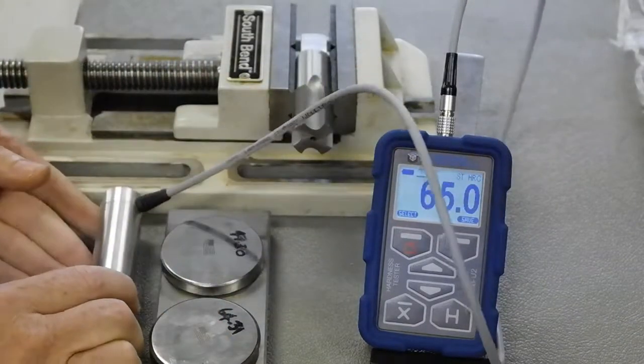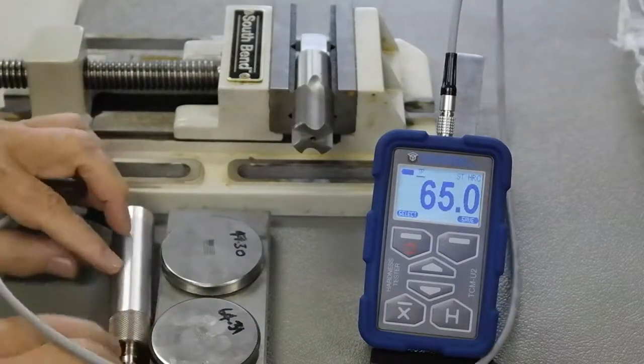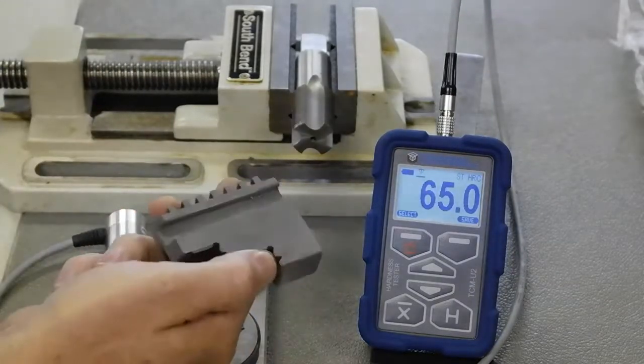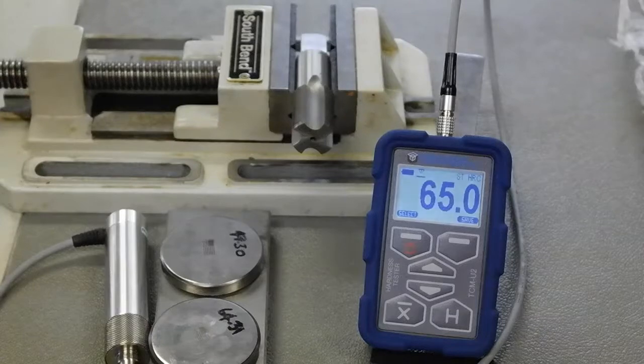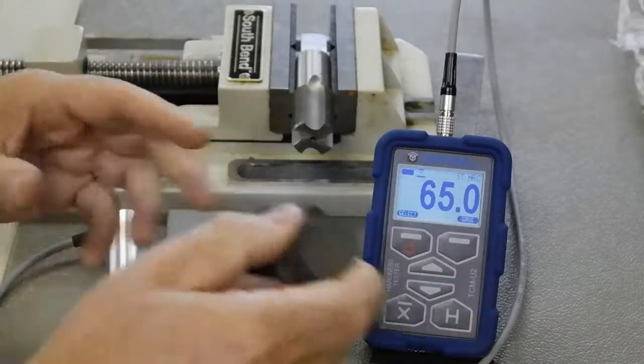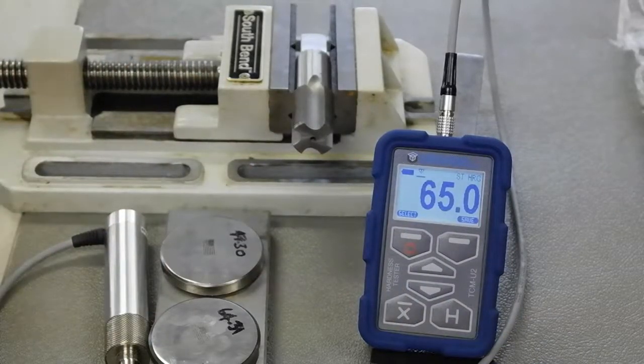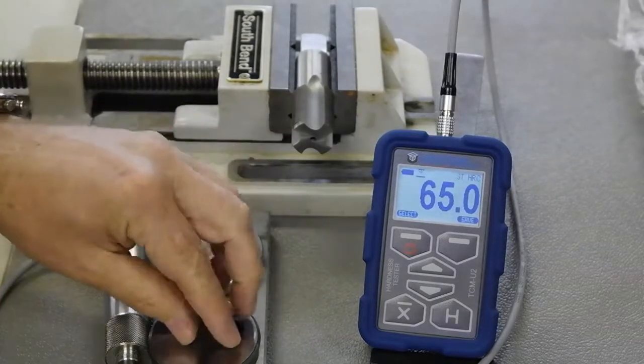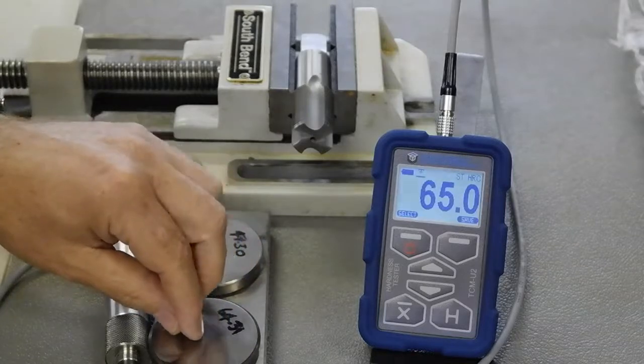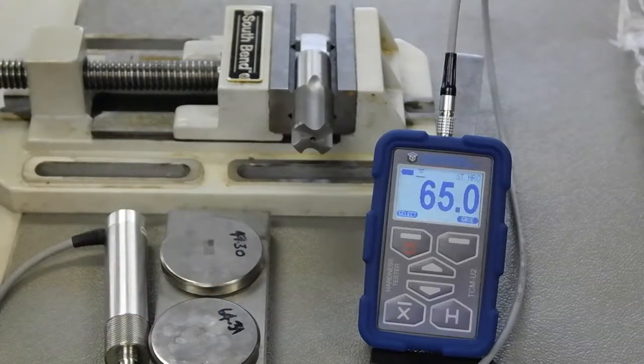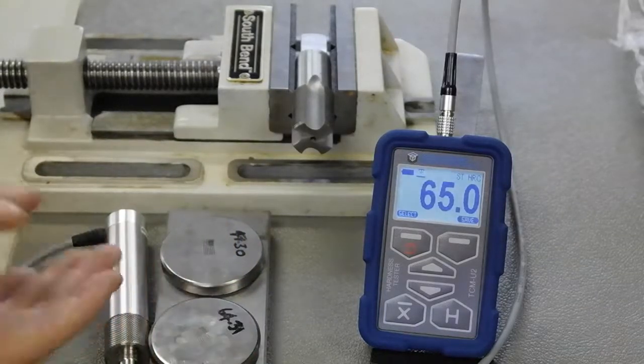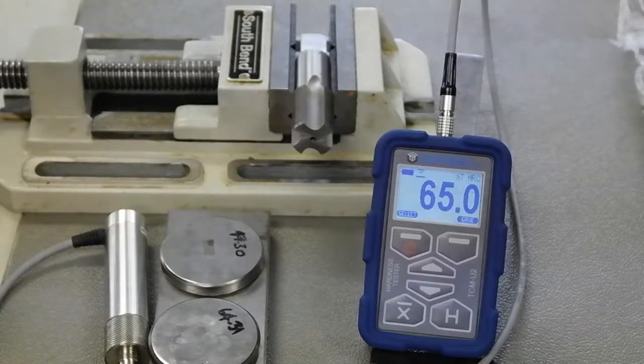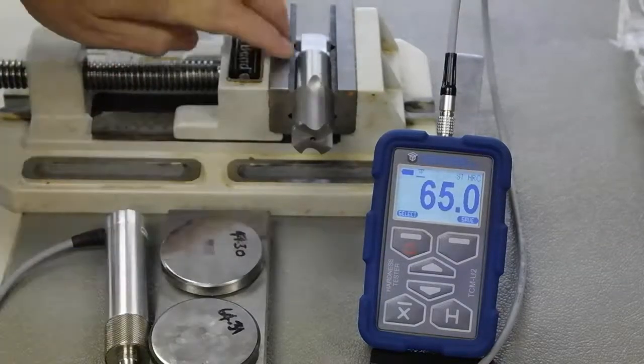So a very very fast, accurate, easy to use product. We can test parts like this, or this, or parts up to very large heavy parts like moulds or even bigger. And if the part is extremely well supported, right down to one to two millimeters of thickness. By supported I mean you can't just have it sitting on a table. It's got to be sitting on some sort of a better support perhaps in a vice or so on.